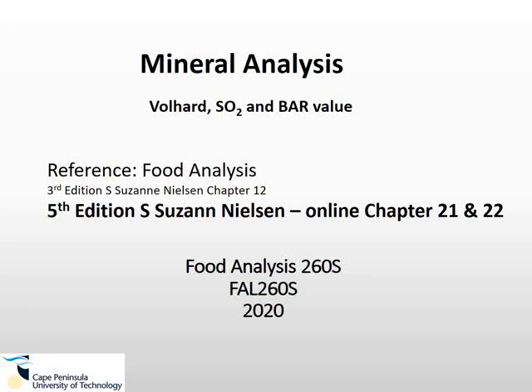Good day, students. This recording is aimed at the subject Food Analysis 2, and in this section we're going to be discussing the theory related to methods that are used to analyze for minerals. In this video we're going to place greater emphasis on the determination of sodium chloride using the Volhard method, determination of sulfur dioxide, and then the determination of the bar value, or what we call the titratable acidity.